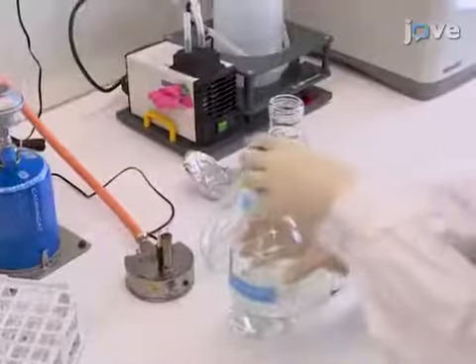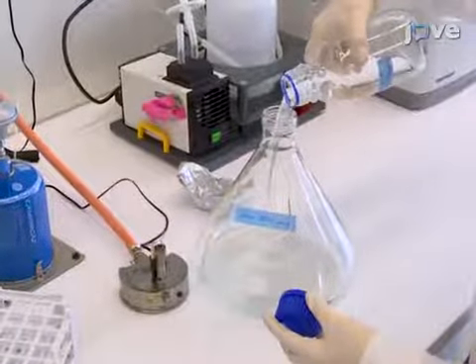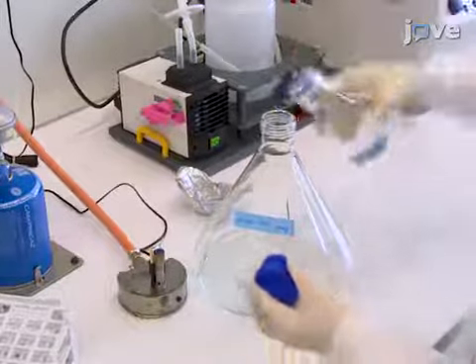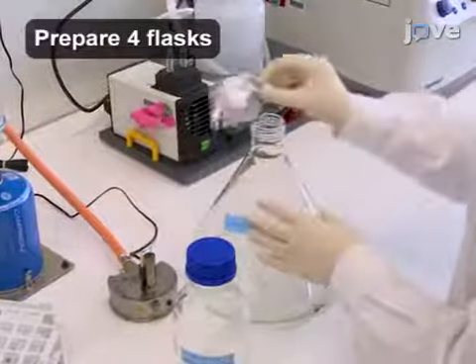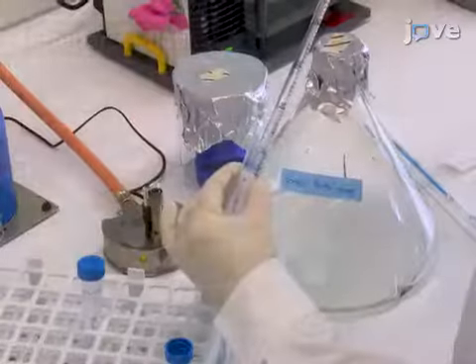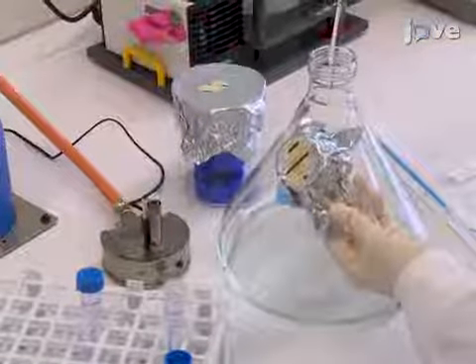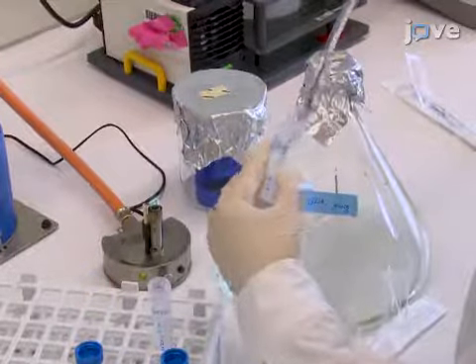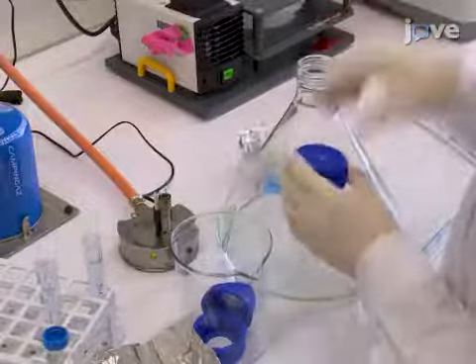To begin treatment, add 207.45 milliliters of S-basal media with additional reagents as described in the accompanying text protocol to a 2800 milliliter Fernbach culture flask. Add a final concentration of 50 micrograms per milliliter of carbenicillin and 1 millimolar of IPTG, and close the flask with a membrane screw cap.